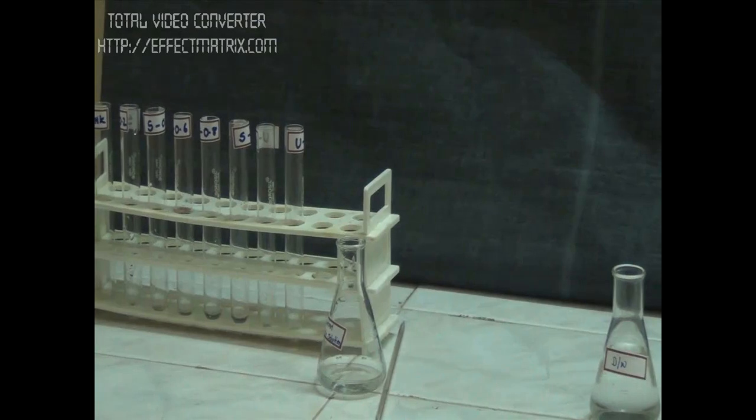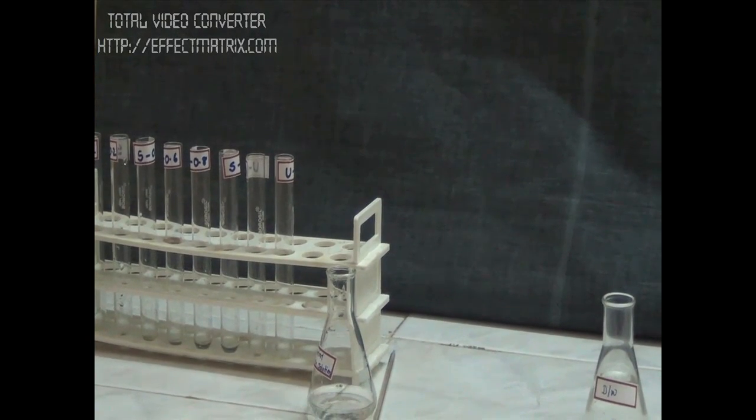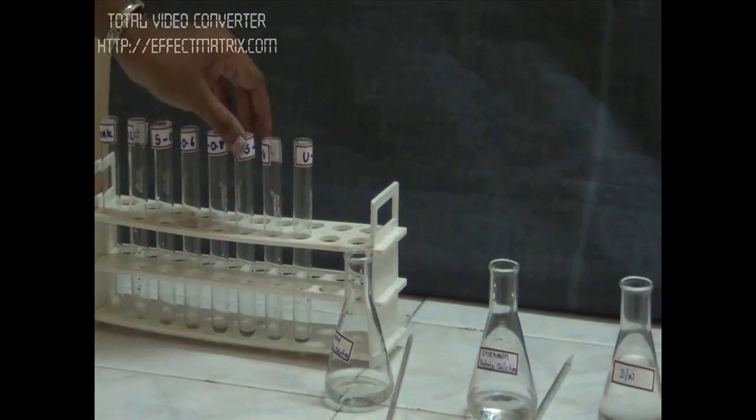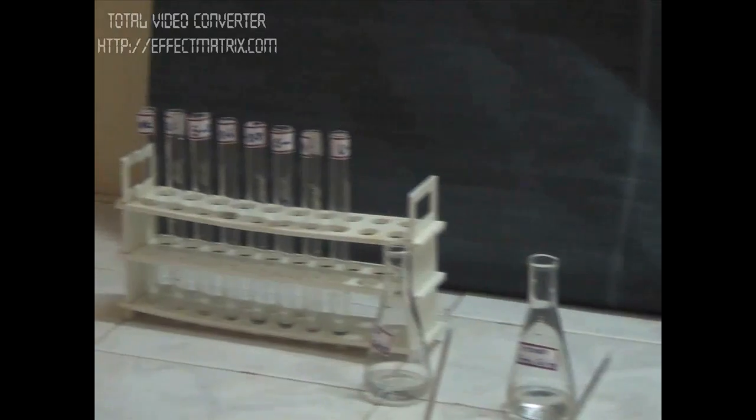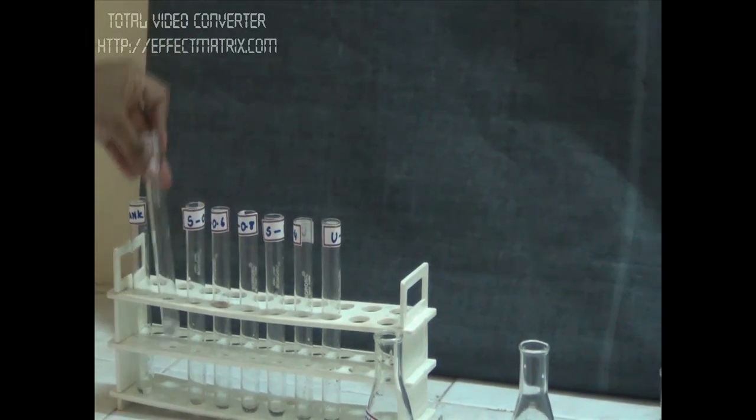we will prepare tubes with 0.2 ml, 0.4 ml, and 0.6 ml. Now we have added standard protein and unknown solution. We will add distilled water to all the tubes to make a final volume of 1 ml. Likewise we will prepare 1 ml in all the tubes.